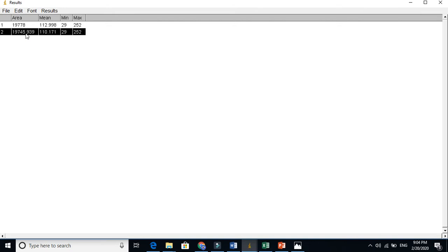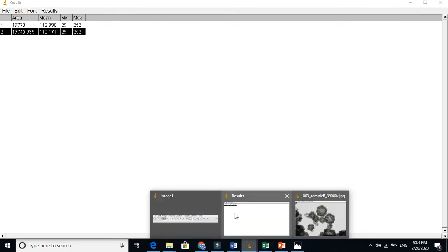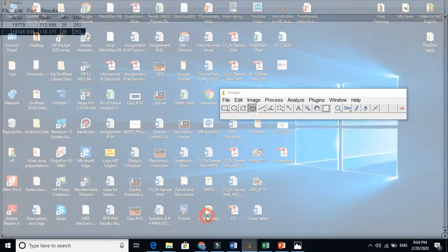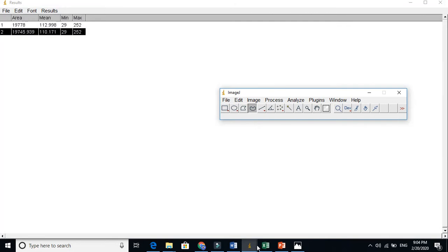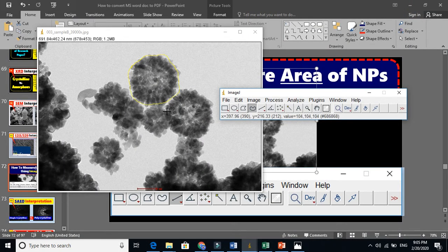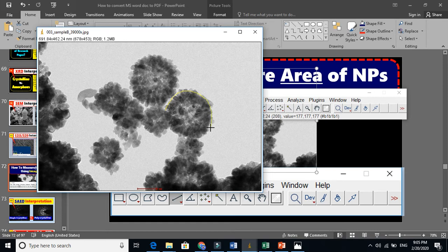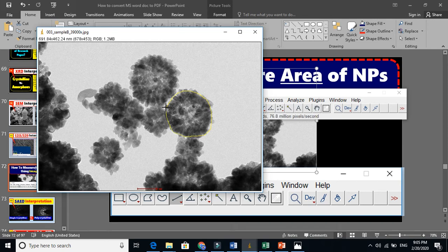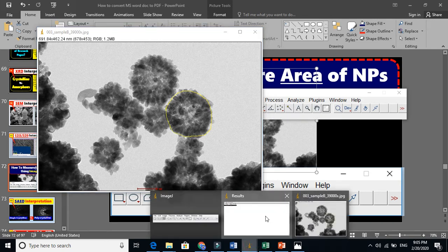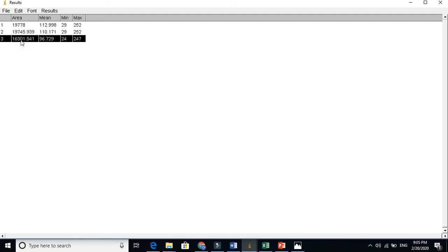You can take as many measurements as possible. Let me take another one. Just take great care when selecting. Press Ctrl+M and you will see this is the third measurement. This one has a slightly smaller area.